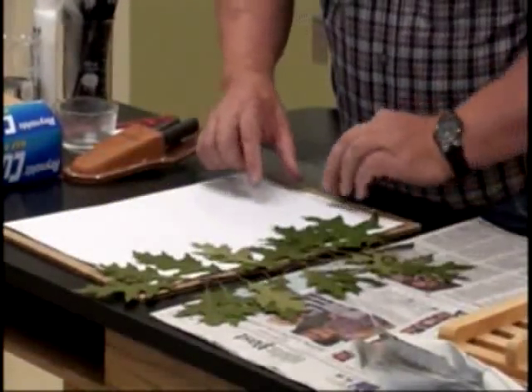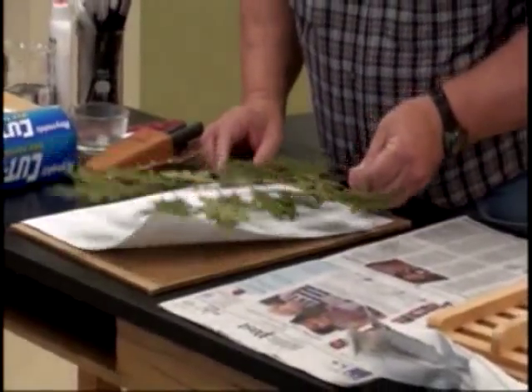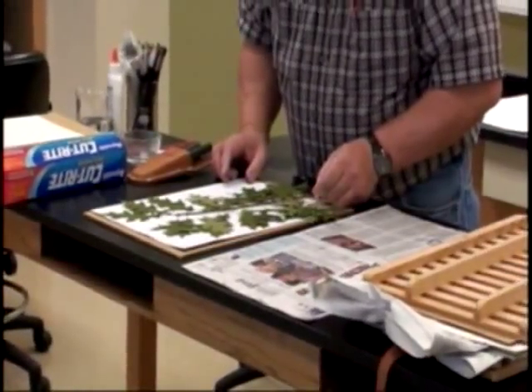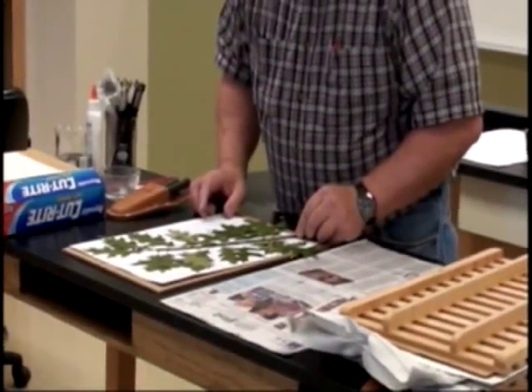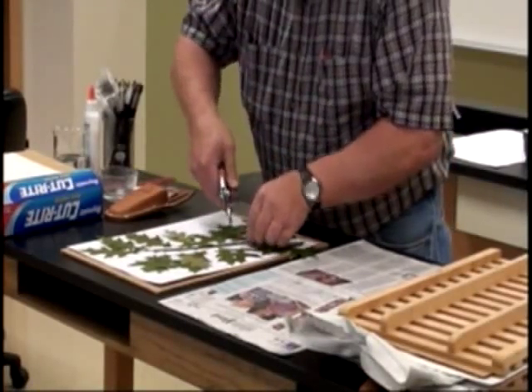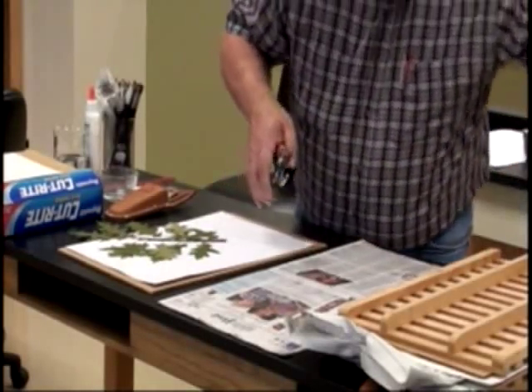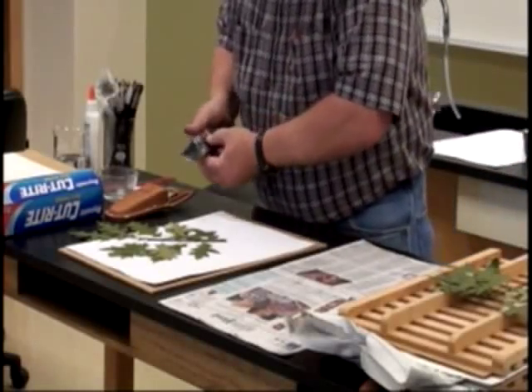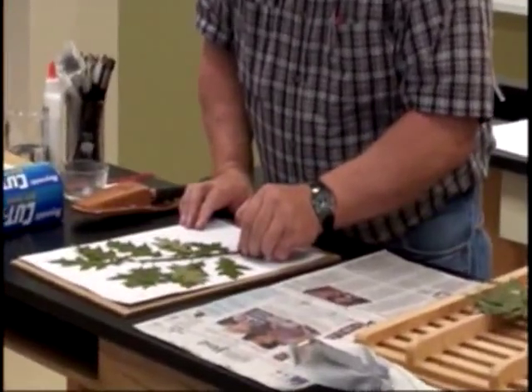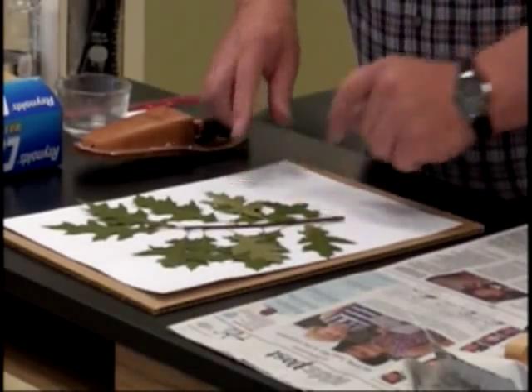We also have to leave room for our label down here in the lower right-hand corner. By placing the plant like so on the sheet, I can come in and snip it off about right here. I take my pruning shears and snip it off. Now I have a plant that will fit on the paper, but still have room for our label down in the lower right-hand corner.